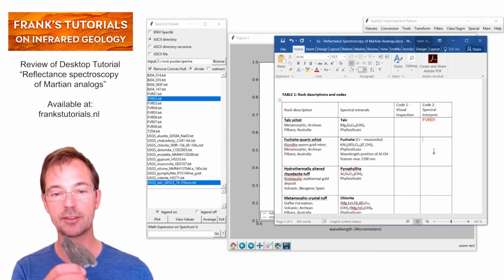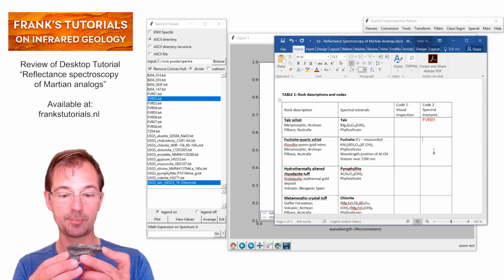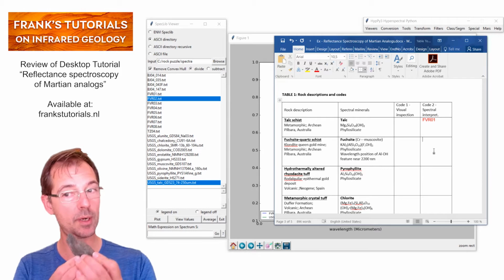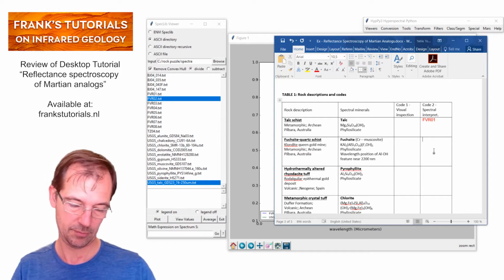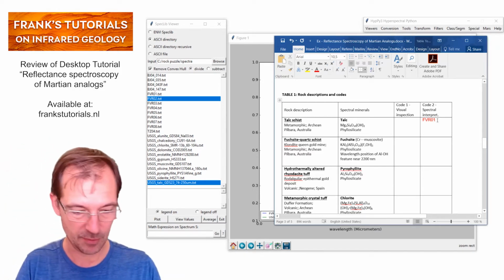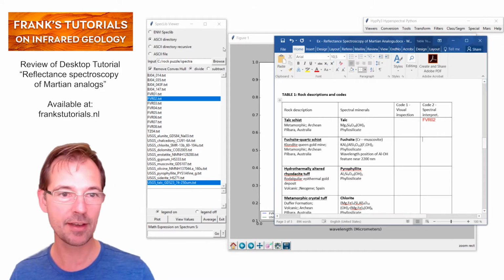The color is typical for Fuchsite, so this is a good candidate to be the Fuchsite quartz schist. It has a code FVR01. I think I made a mistake. The talc schist should be FVR02, of course. Yes, and this is FVR01.